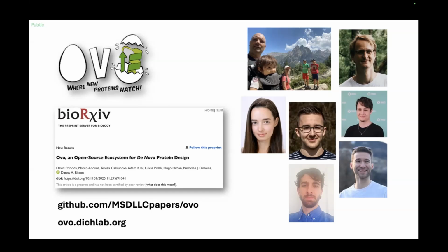People are also asking, this is a little bit out of scope, if you have any idea which metrics are most correlated with experimental success. We'll know more on that. I don't know if there'll be a publication, but for now we tried to set the defaults as best as we could, and this was really consistent with the literature, so we don't have any new insights yet to share.